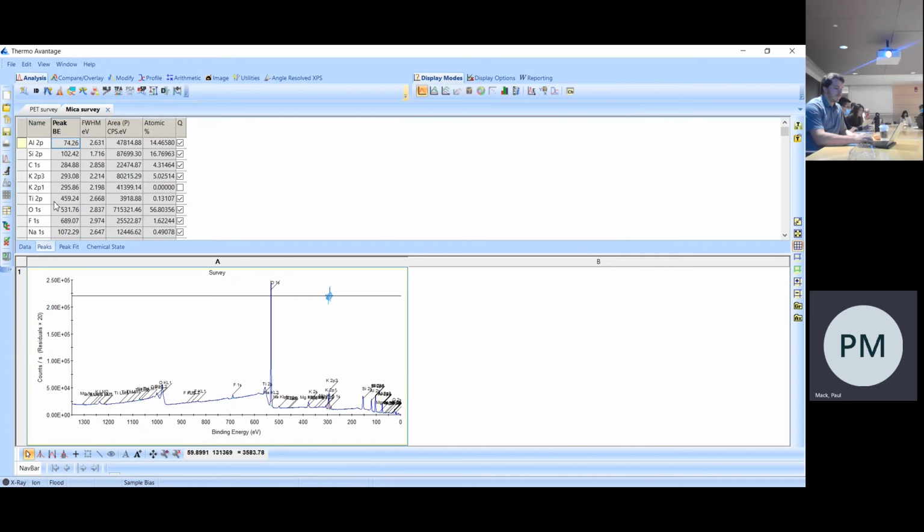And you can see here we have a peak table now, just as before. You can also see ESP has added in a lot more information as well, some of which is overlapping, which is hard to see. So either button is a good start. If you have a survey spectrum, do the auto ID first, just to get you started, and then go ahead and do the manual check, just to make sure that the auto ID has got it right. Don't ever trust them fully. You ought to make sure that you've inspected the data yourself.